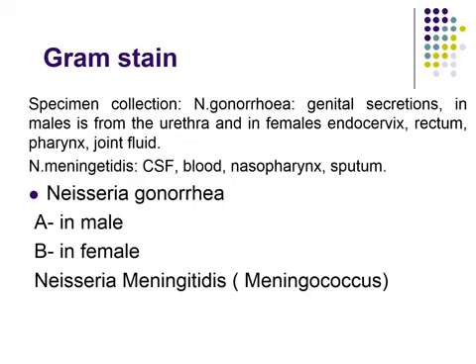So a direct swab from the urethral discharge is taken, then a gram stain is prepared to diagnose the causative agent.